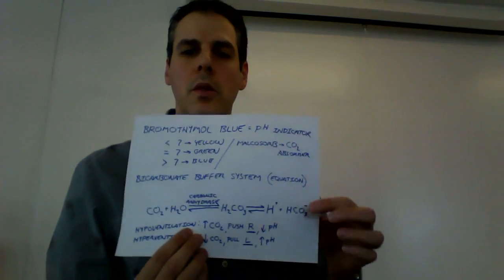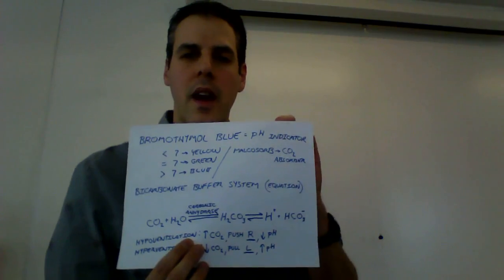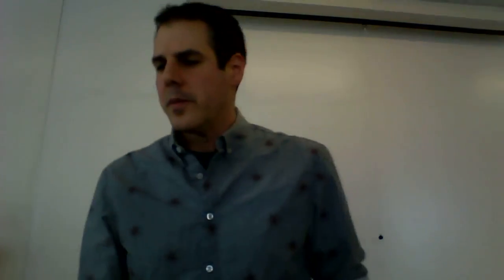Basically, it's just to reabsorb all the carbon dioxide to keep your pH. So it's not an air, CO2, oxygen thing. It's actually a pH thing, trying to balance this reaction a little bit better. So I have a little experiment that we can do. And so this is the bromothymol blue experiment.